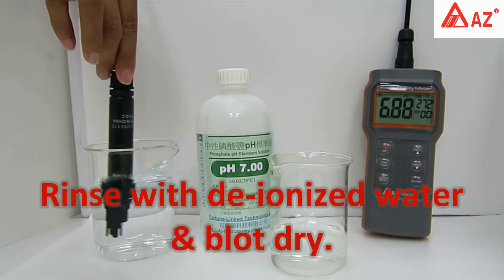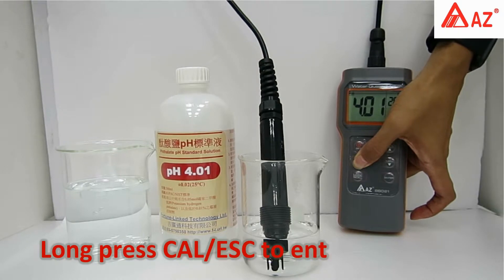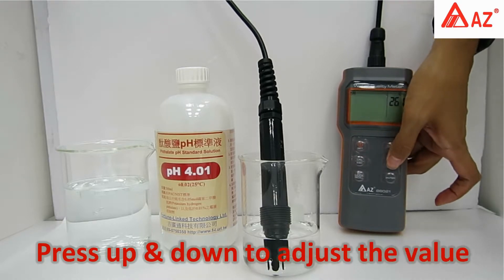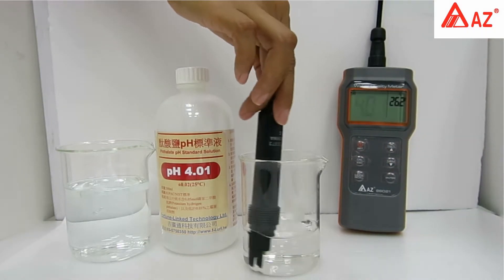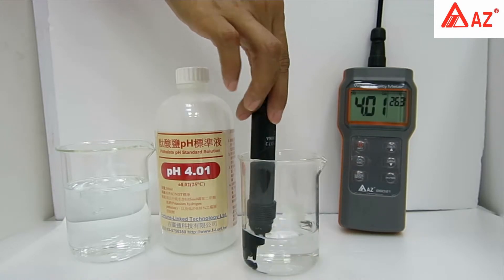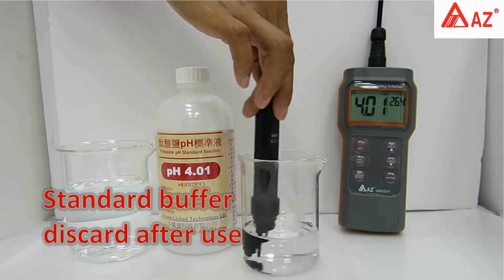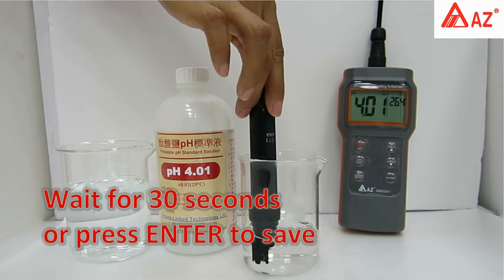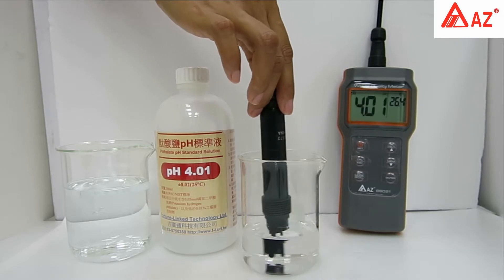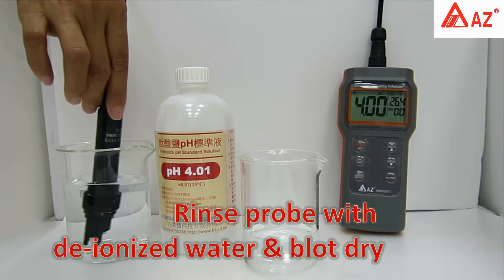Rinse the probe with deionized water and blot dry. For pH 4, long press Cal to enter calibration and set the standard value using the up and down keys. Use a transparent container and make sure the pH electrode is completely immersed in buffer. Stir gently to get a homogeneous condition. Do not reuse standard buffer. Once the reading stabilizes, press Enter or wait for the save icon. Rinse probe with deionized water after use and blot dry.